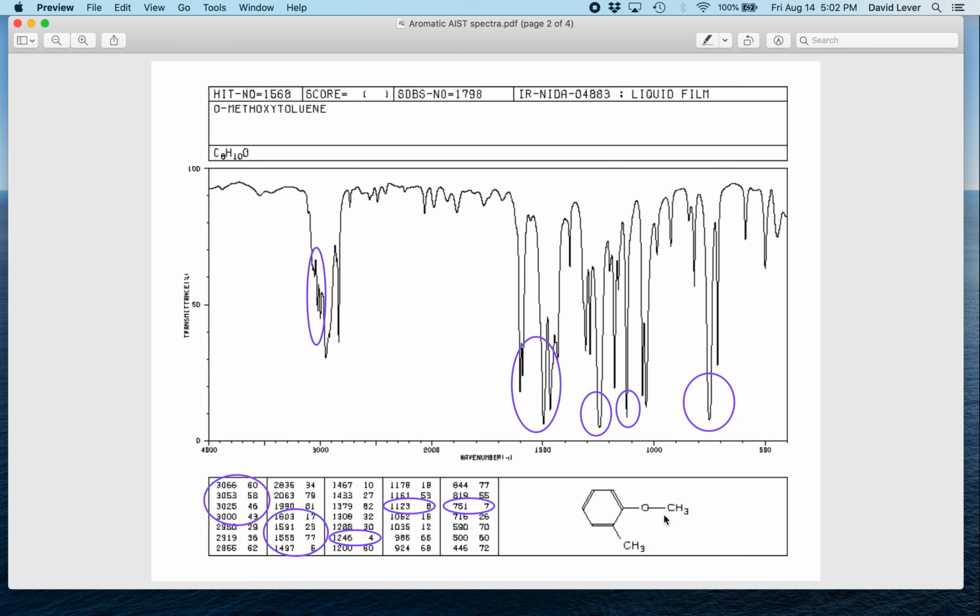An ortho-substituted benzene, in this case we've got 2-methylanisole, methoxybenzene has the common name anisole. So it's either 2-methylanisole or 2-methoxy or ortho-methoxytoluene, depending on whether you name it as a parent from the methoxy group or a parent with the CH3 group.